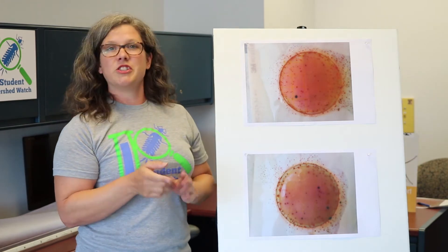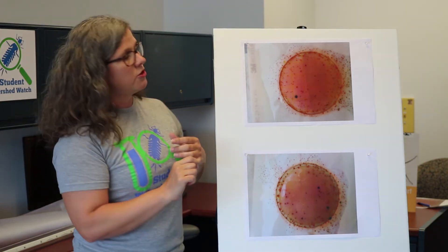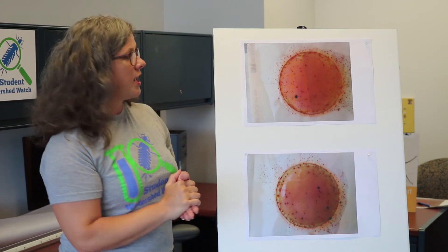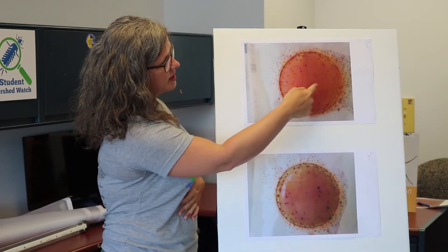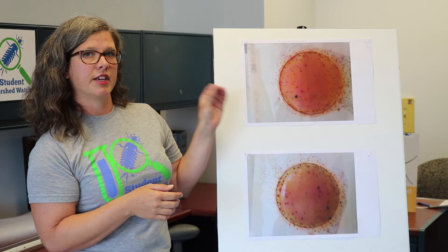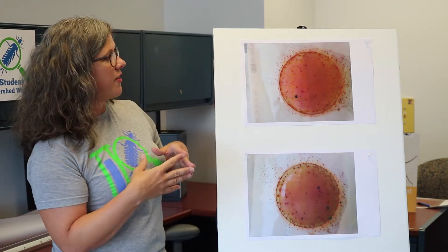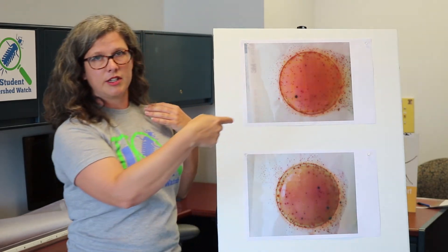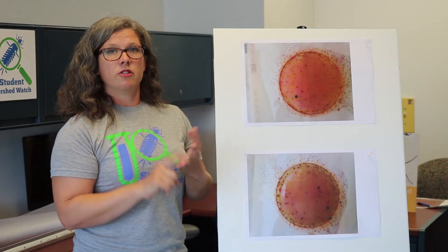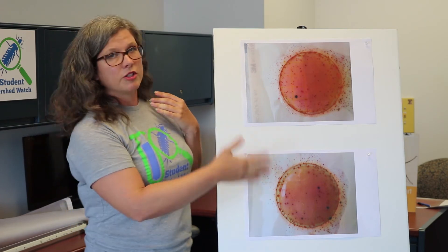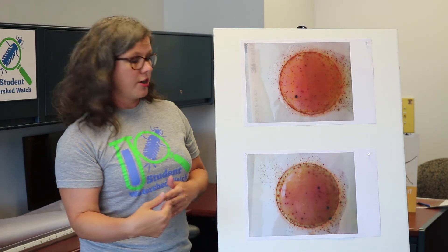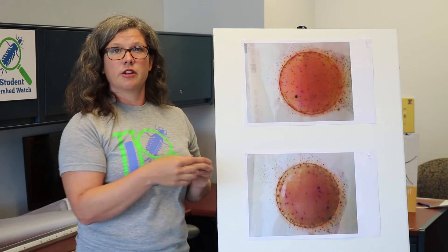There are a few ways you can get counts. The first is to do a total count. In this case, we just have two blue colonies, so we have two E. coli. When you look at the rest — the coliform colonies — they are pretty numerous, but we can get a count from a few squares, take an average, and then multiply that by 20. There are 20 squares in each circle, so that gives you an estimated count. Once you get your total count or your average, you want to multiply by 100. The final units you'll report in will be colonies per 100 milliliters of water, and since this sample is 1 milliliter, you'll extrapolate from there.